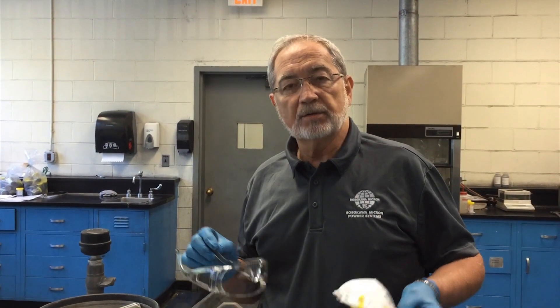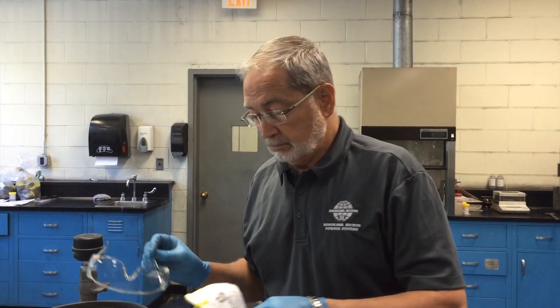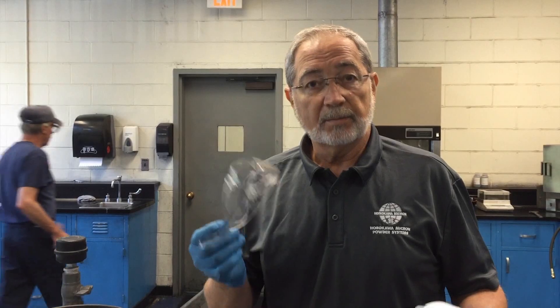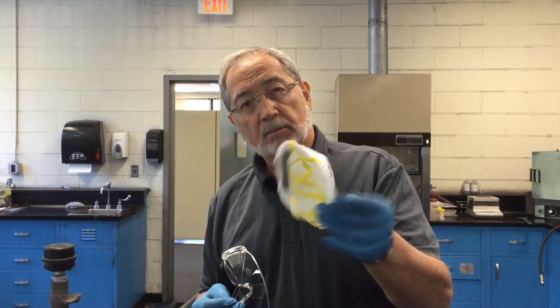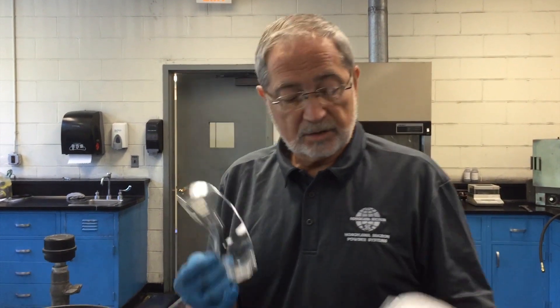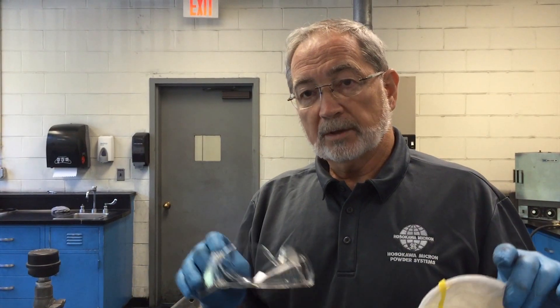Today we're going to talk about how to maintain your air jet sieve. Prior to starting the inspection of the unit, we're going to make certain that we all have our protective eyewear, protective face mask, as well as gloves. This will all be predicated upon your requirements as far as your company and facility.